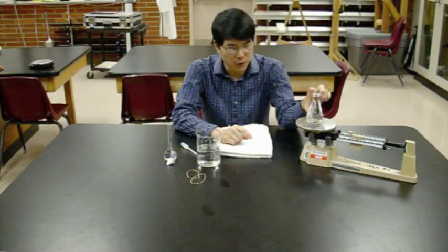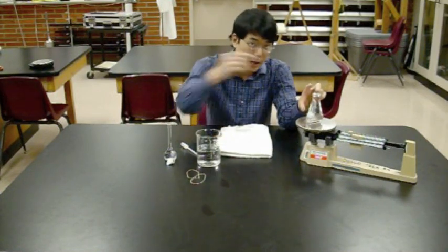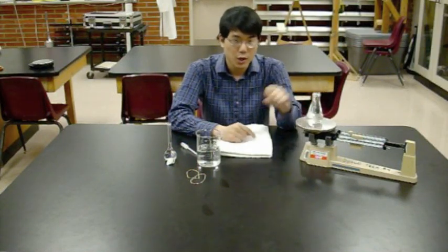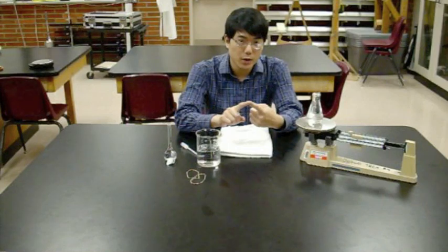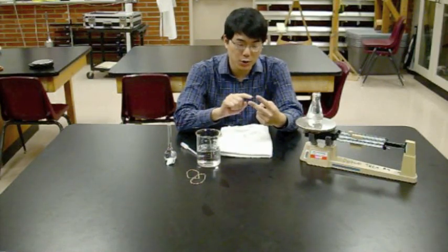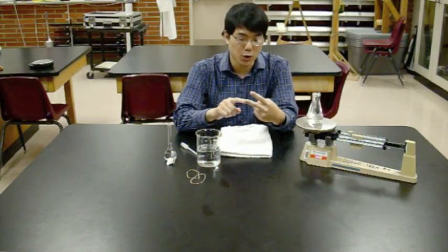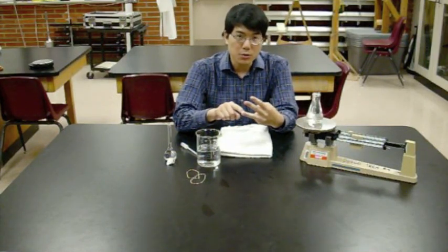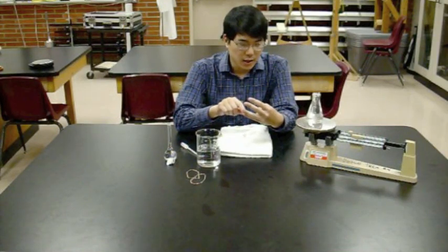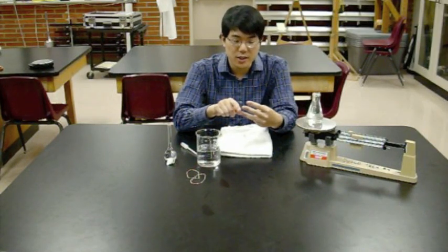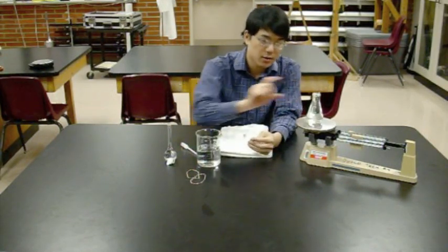And then figure out the volume of the interior of your Erlenmeyer flask. Now, way back in part one, that Erlenmeyer flask was full of your unknown vapor. So now you know the volume of your unknown vapor. From your measurements in part one, you'll know the temperature of the unknown vapor. That's the same as the temperature of the water bath. Based on these three measurements, you can calculate the moles of gas that were inside this flask when it was in the hot water bath.